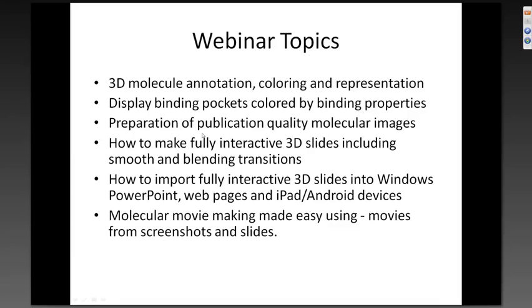Show you how to prepare publication quality molecular images, and how to make fully interactive 3D slides, so you can make a representation of your molecule and save it as a slide, and then you can change that and always come back to that same slide. And then how to import these slides into PowerPoint and web pages, and also you can view them on your iPad or Android devices using iMoleView, which is a free download from Google Play and the Apple Store.